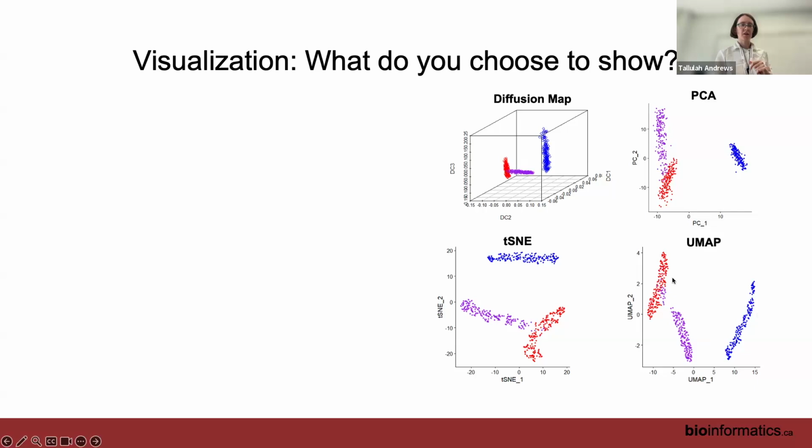Whereas UMAP, which stands for Uniform Manifold Approximation and Projection, or something like that, again is just related to the math behind it. It doesn't really matter for using it. But UMAP is based on links between cells, especially local links between cells. So it tends to create very dense groups where you have cells that are close together, as well as sort of strings between groups of cells. That's its main assumption. The other one I'm showing here is a diffusion map.